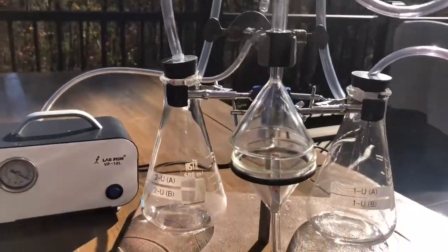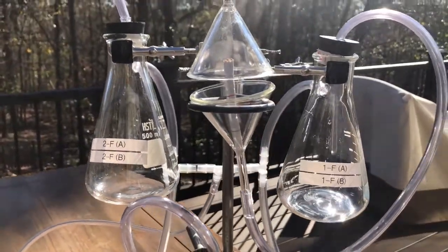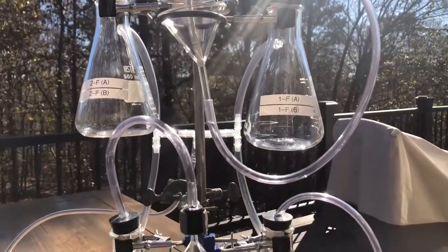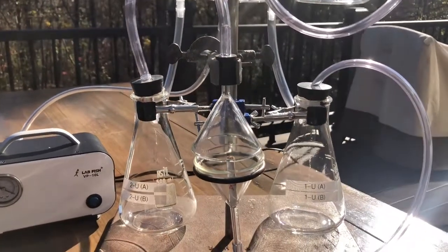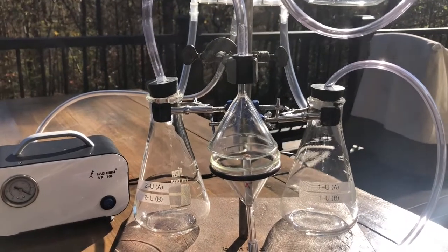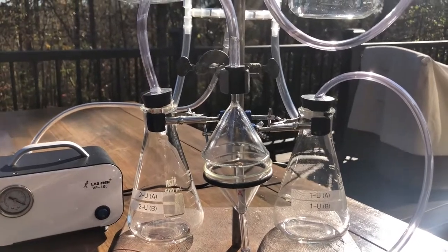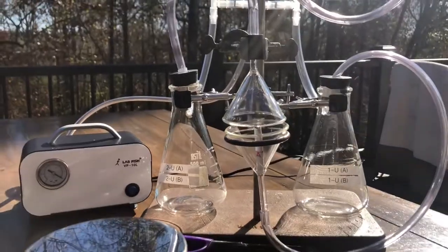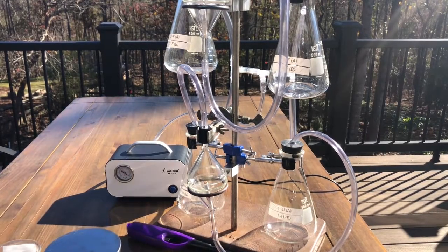Okay, it's important that we leave a little air gap between the funnels because, as you know, combustion requires oxygen. So now what we're gonna do is we're gonna turn on the pump and cross our fingers and see if we can light these guys. And we're gonna try to get them to burn all the way down to that little red line, and then we will break the seal between the pump and the cigarette itself, and then we will get masses for the filters with the solids collected on them. Okay, so here we go.